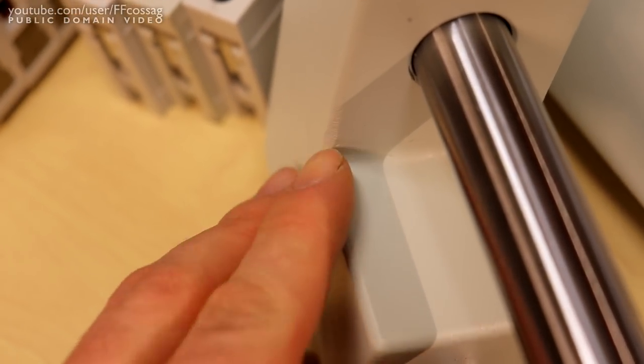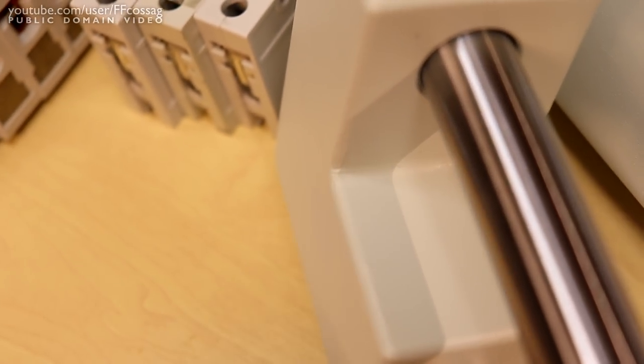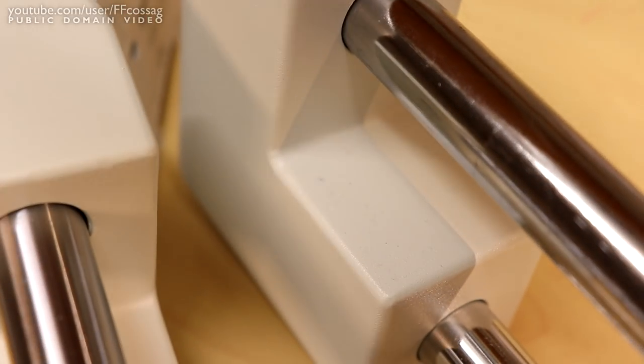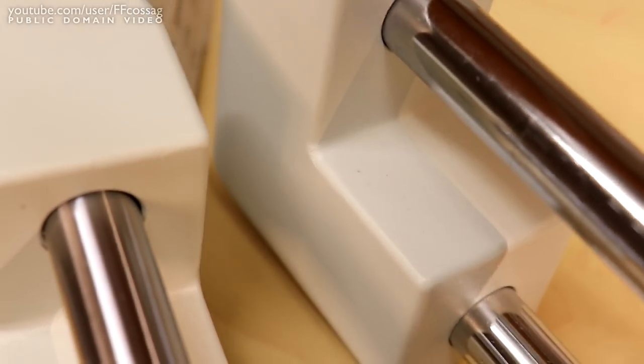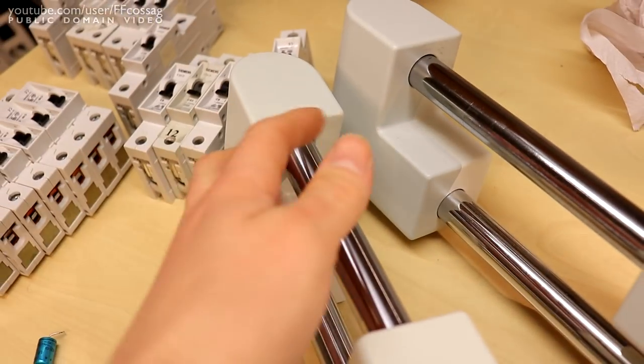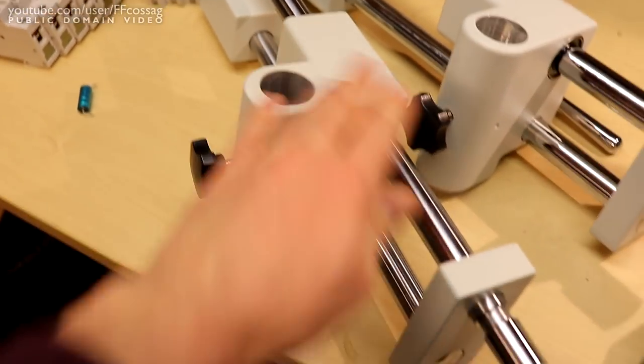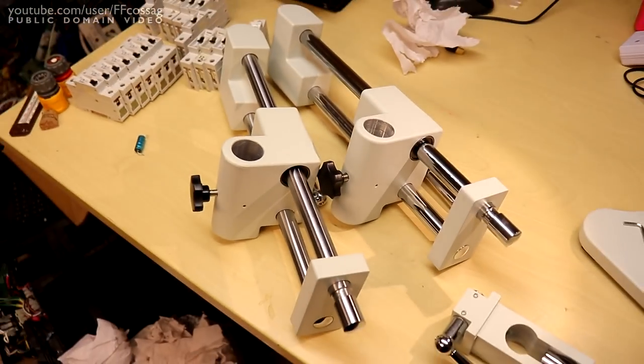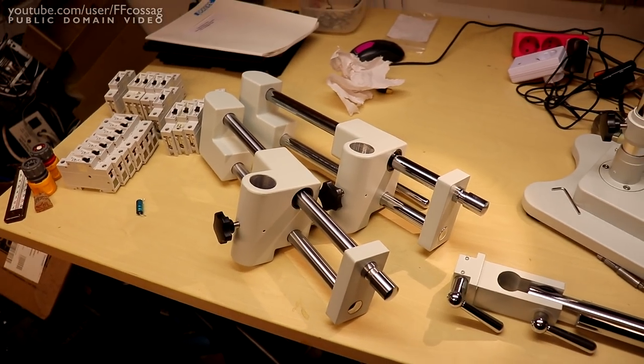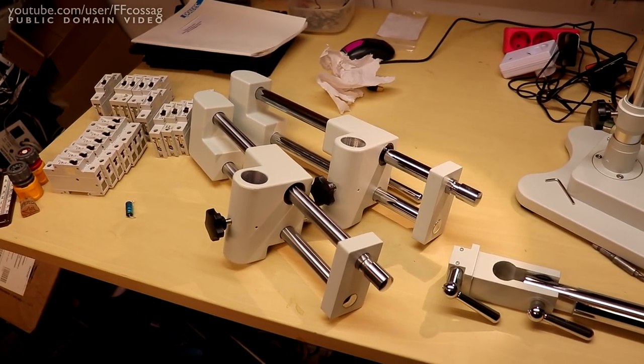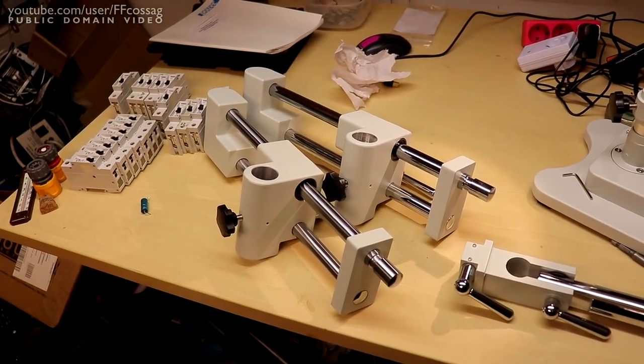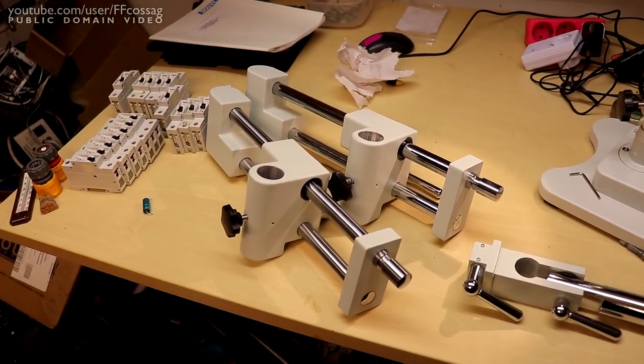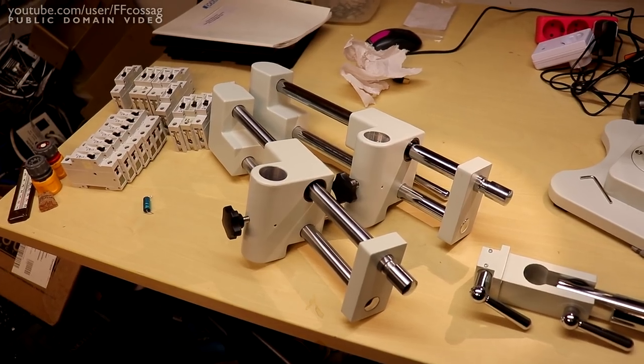You can also see the workmanship on the new one is not as good as the workmanship on the old one. That corner there is a lot cleaner and generally this piece is a bit dirtier. All the white pieces are a bit coarser on the new one. But let's get the new one installed and see how it rides.